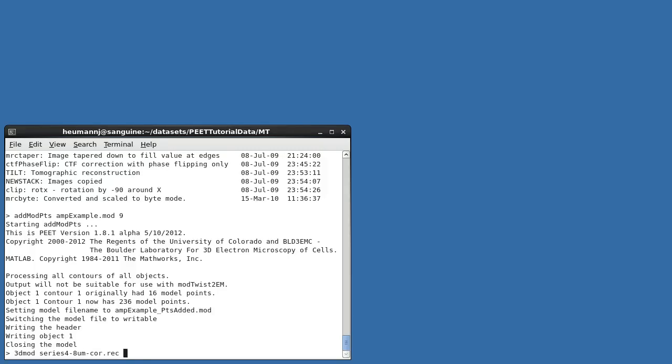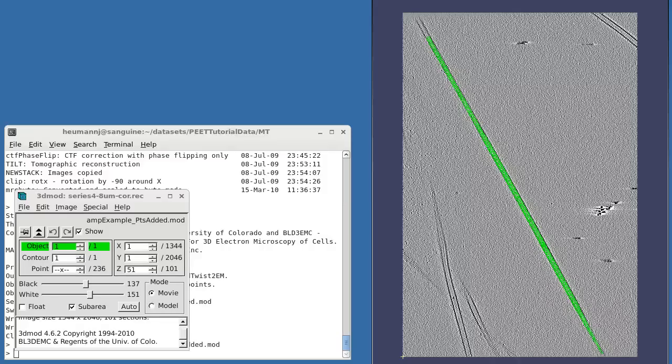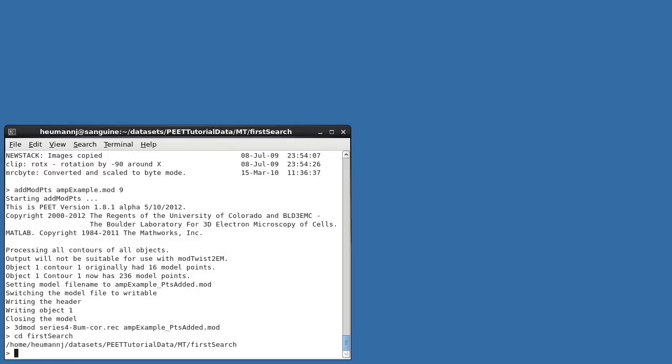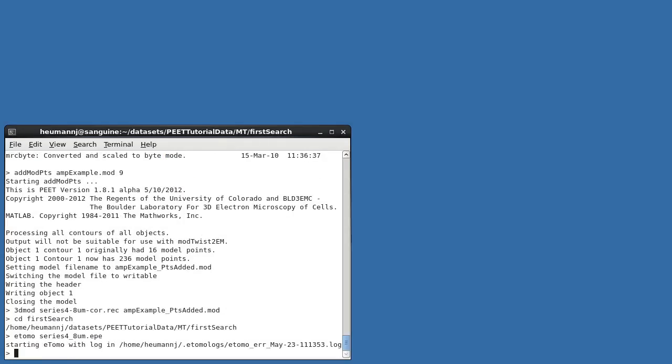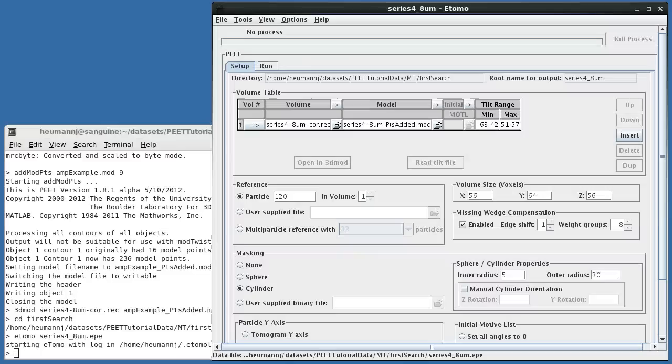addModPts creates an output model with points added appended to the original model name. If I open the resulting model on our volume, you can see that the points have been added as requested. Settings for an initial alignment have been placed in prm_Series_Kinesin8_FirstSearch, so let's open this project and take a look at those settings.